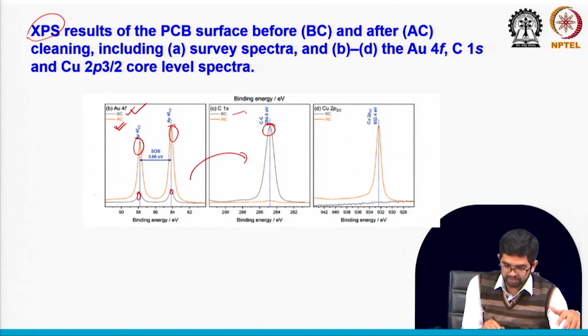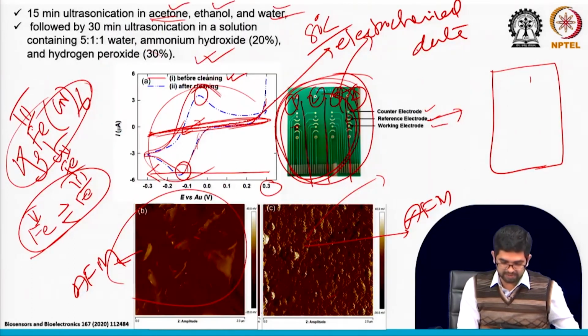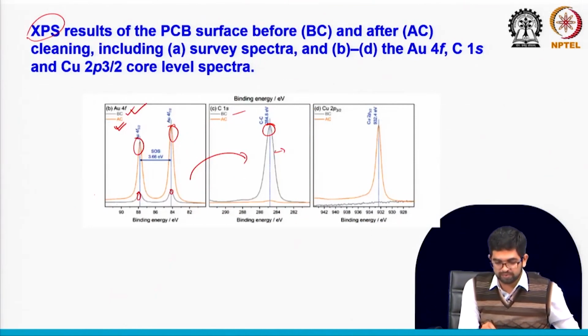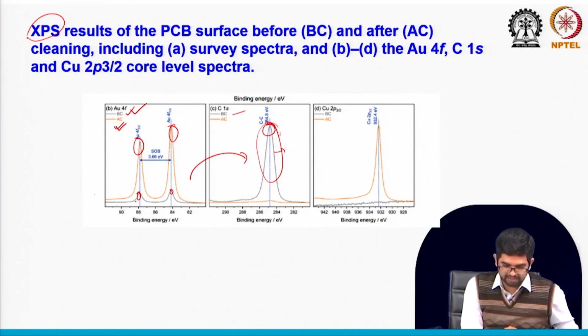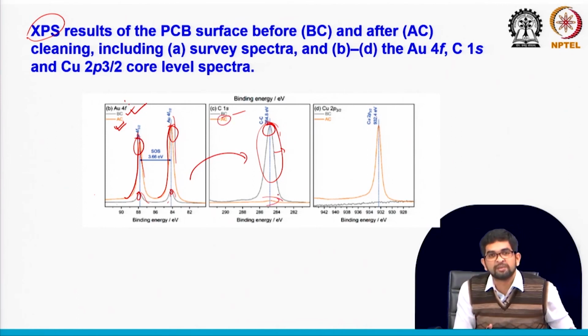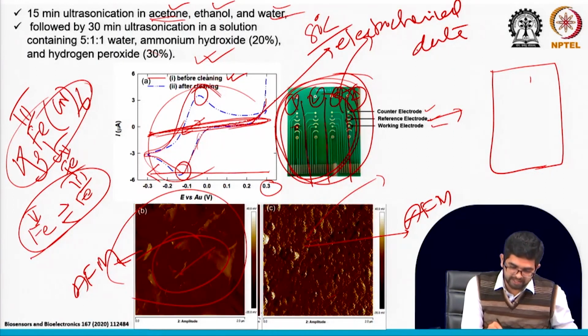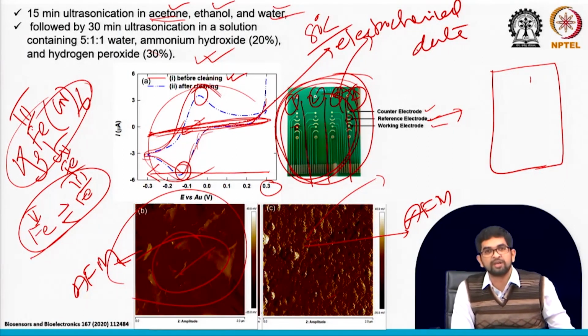Before cleaning you have a huge carbon peak. That is why you can see the AFM image is almost covered by the organic contaminant. You can clearly prove that there is a huge contamination of carbon material. For the before-cleaning case, the gold peak in the 4f region is very low. When you go for cleaning, you can observe a very good peak, and after cleaning the carbon peak almost diminished, meaning there is almost no contaminant now and carbon is almost removed from the surface. That is why you are getting very good reversible Fe2+/Fe3+ cyclic voltammetry here.